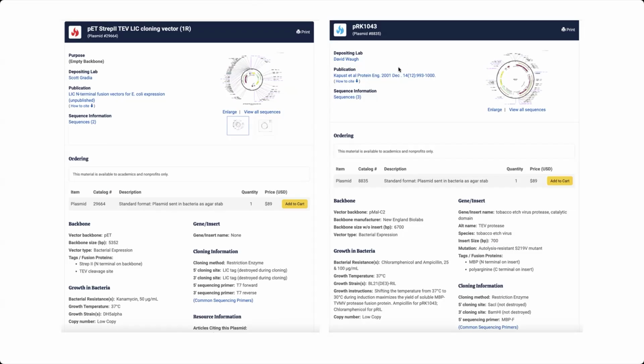Whereas this one is the plasmid for TEV protease, and we actually want this protein, which is going to allow us to cut the tag off of the protein that we eventually make with this plasmid. In this case, this is coming to us in those BL21 DE3 RIL cells. And so it's in those expression cells that have that extra plasmid with the rare codons. And so you don't always need this. Most of the time I just use straight BL21 DE3. But for some proteins, they express better when they're in these strains with those tRNAs for those rarer codons.